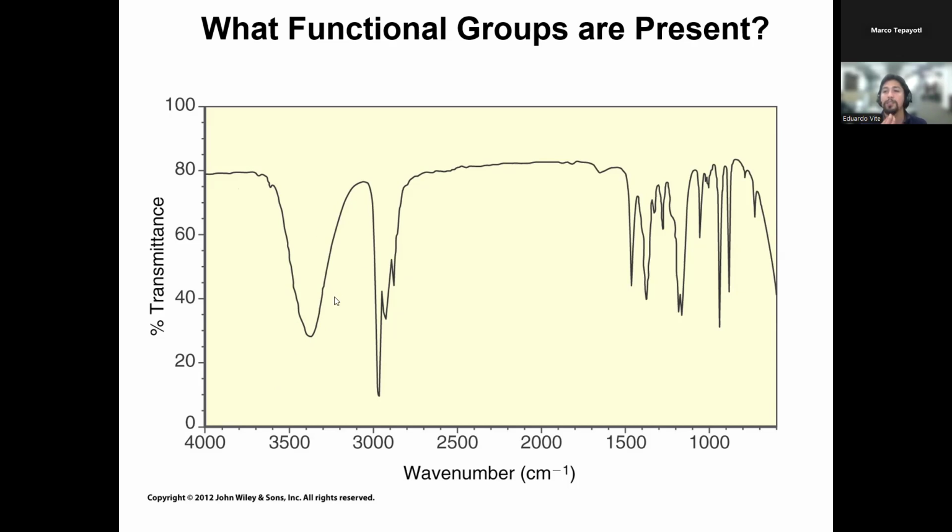And since you don't see the bottom peaks right there, there is no beard. That means this is not a carboxylic acid. The peak at 3000 is just your standard run of the mill carbon hydrogen sp3 stretching. And since there's nothing else between 1500 and 3000, this is strictly a molecule with only an alcohol functional group. So it's probably butanol, or pentanol, or hexanol, or something like that.